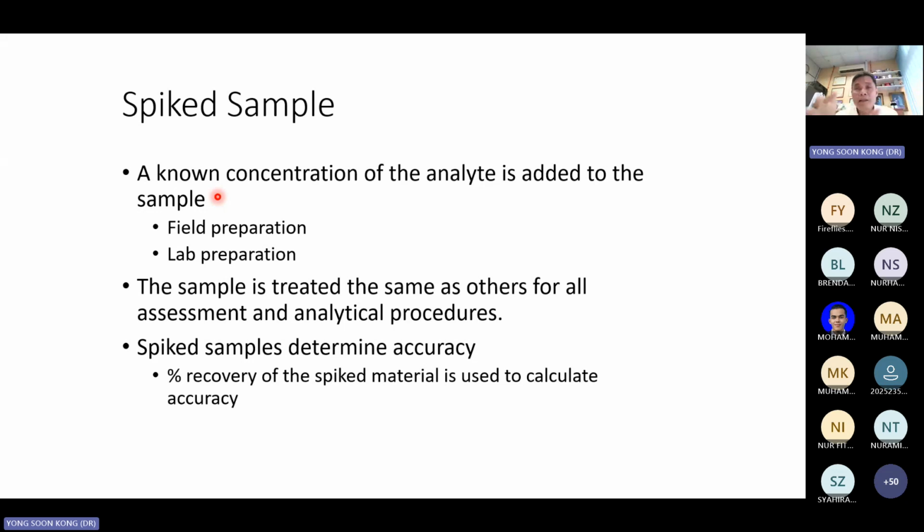Bawa balik ke lab, pergi analyze, then dalam sampel air tu, you kena pick up lah, ngam-ngam 1 milligram. So bayangkan, kalaulah masa analisis tu tak dapat 1 miligram per liter, apa maksud dia? Senang kan? Kita dah masuk 1 miligram, mestilah dapat balik 1 miligram kan semasa analisis. Ini bermaksud there is inaccuracy in somewhere.